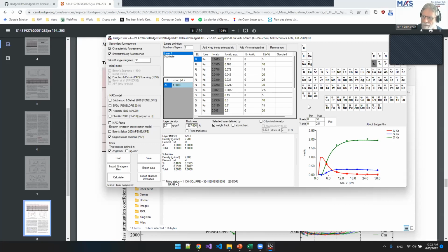Yeah. In the case of atomic layer deposition, where the people who do that type of synthesis are pretty confident they've produced alumina or titania or whatever it is, can you then fix the composition of the film and just iterate for the thickness of the film? Absolutely, yes.